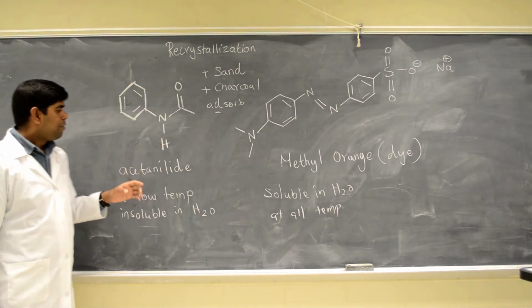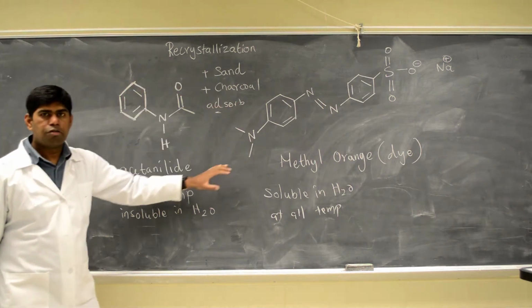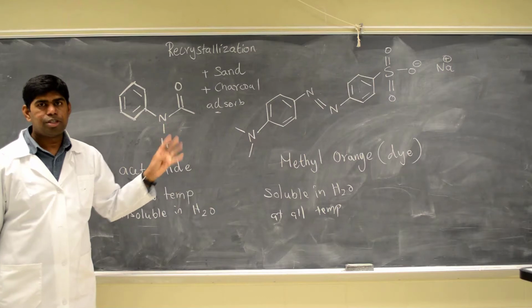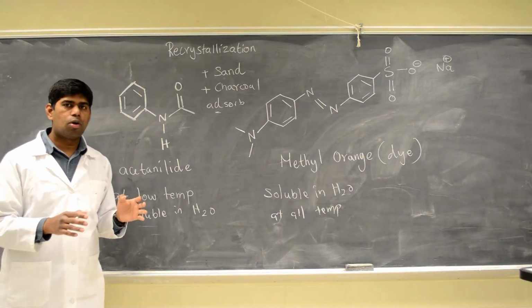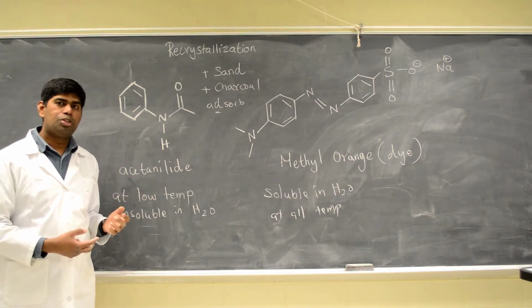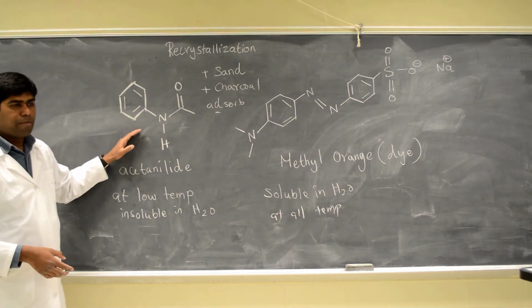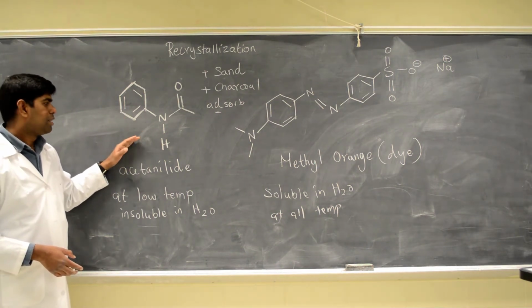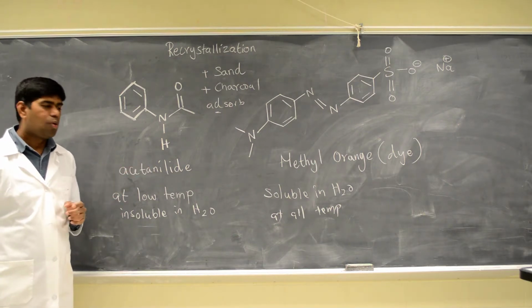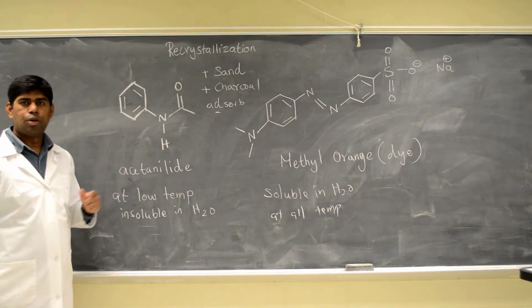So at the end, we're going to purify acetanilide from the mixture of four substances. They're all solid. We're going to dissolve them in hot water and change the temperature, and do a couple of filtrations. At the end, we're going to get pure acetanilide, a white substance, and we check the melting point to verify our product. Right? Let's go to the lab.